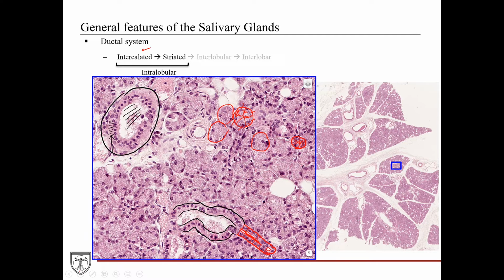Before we move on, let me just point out some of these stromal cells that we can actually see at this level. Here's a unilocular adipocyte. Here's another. So some unilocular adipose infiltrations can be appreciated, arterioles, capillaries, and some of these flattened nuclei outside of the acini often belong to those myoepithelial cells.